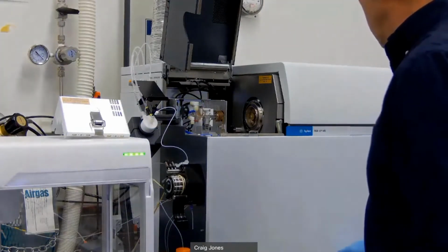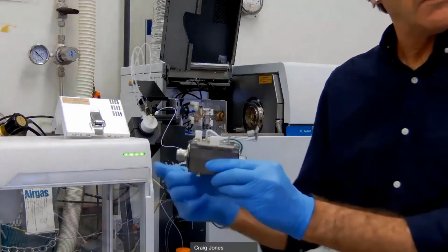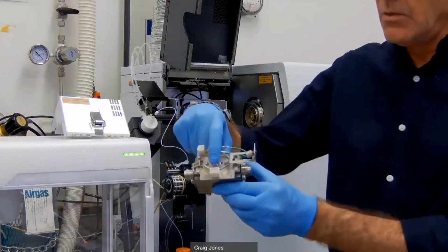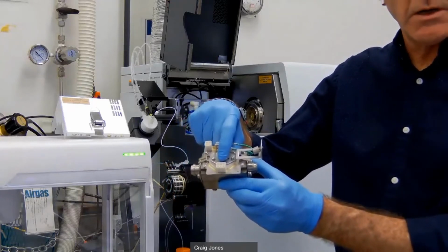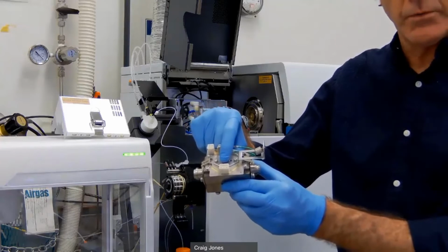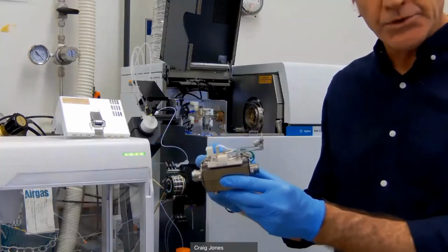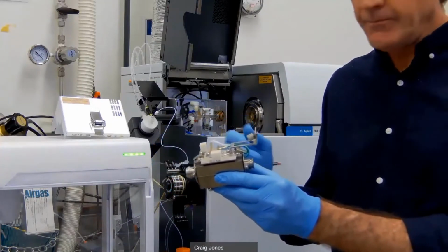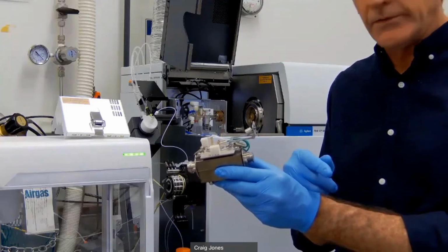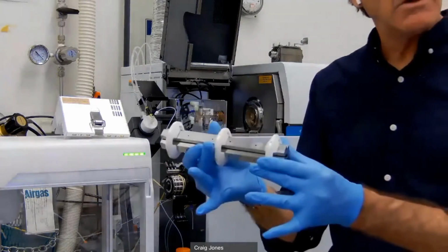All right, so after the lens assembly is where our cell comes in. The ions, after they go through that skimmer cone, enter into the cell. We bleed in helium mode. We can also have a hydrogen mode if we need low detection limits for just a handful of elements, but typically helium mode is the way to do it. That helium then knocks out those larger polyatomics that interfere with the associated analyte of interest, and slows them down because we have a little bit more positive on the back end, so that only the analyte will exit out of the cell. Once it exits the cell, it goes into our quadrupole.